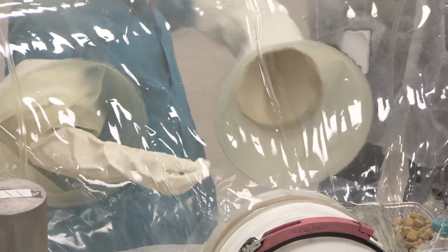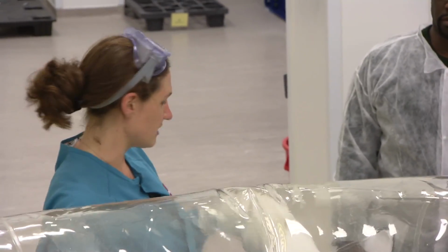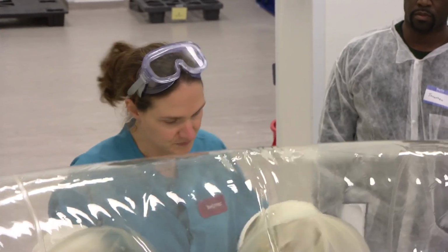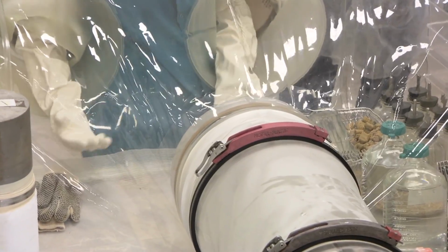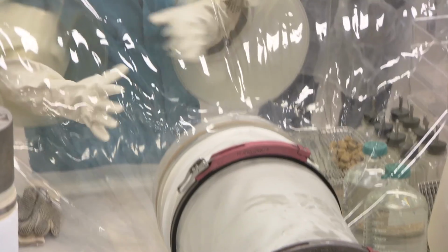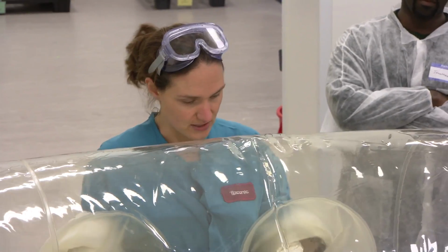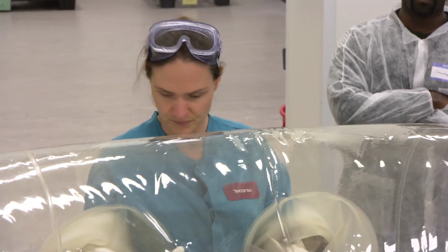Lots of times it's easier to look at your sleeves outside of the isolator. It's always good practice weekly. Pull your fingers inside out and take a peek from the outside of the isolator. So that way, once you get started, if you do have a hole, you can get it patched immediately, and you aren't in here moving around and changing the pressure within the isolator, and you have a hole. So that way you can get everything sealed up if you do find something. So we're ready to go.